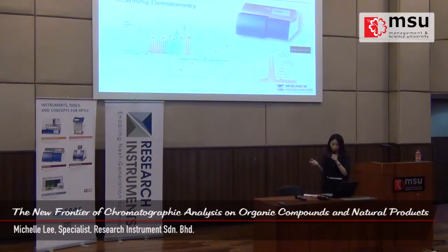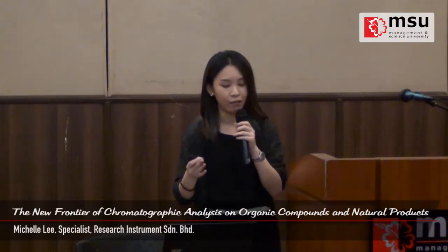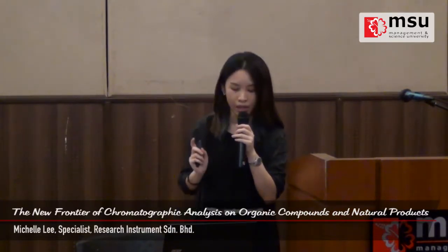Just now I talked about the fingerprint, which is a kind of qualitative analysis. Nowadays TLC can also do quantitative analysis, which means the component is already known to you, you have already identified it, but the next step is that you want to quantify it. You want to know the concentration. So TLC can do that as well.